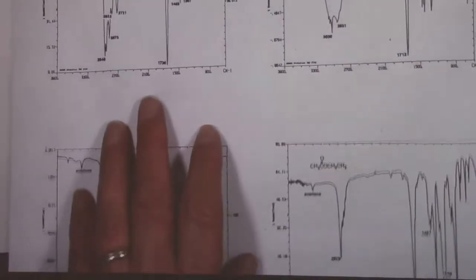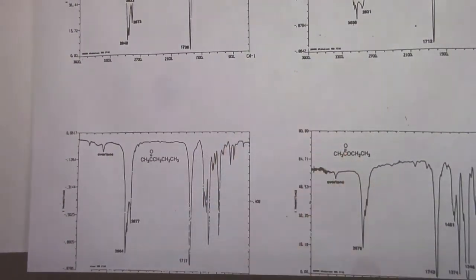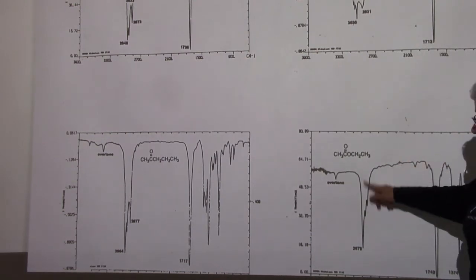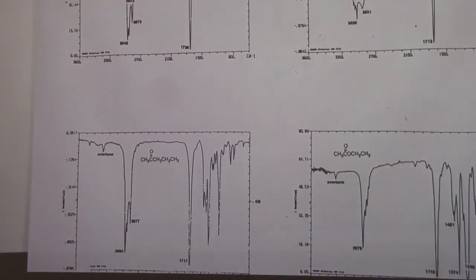Not that sheet, that looks like an alcohol. How about that sheet? That's better. All right, so I'm going to put all 4 of these up here because that's the page you're looking at. When you look at these spectra, what they all have in common, fingerprint aside, CH stretches aside, right? They all have the CH stretches. What peak-ish, not overtone, what peak seems to be very distinctive, very deep, and common on all of them?